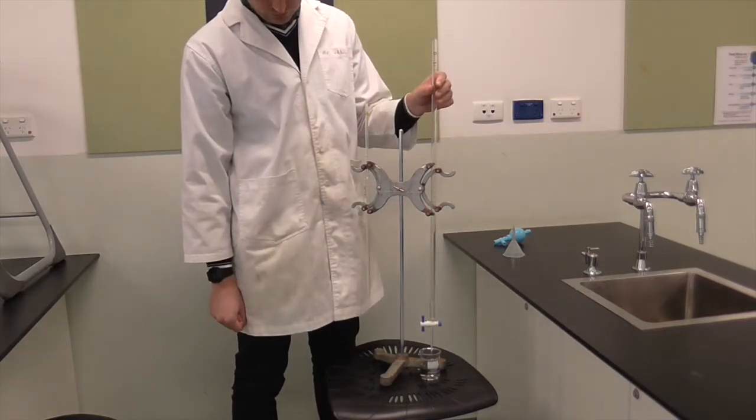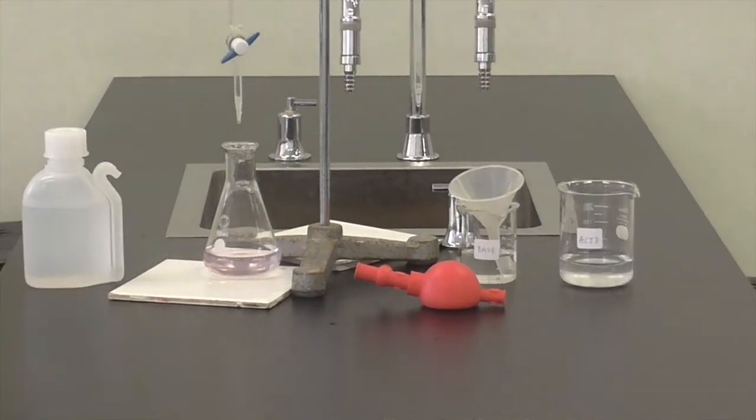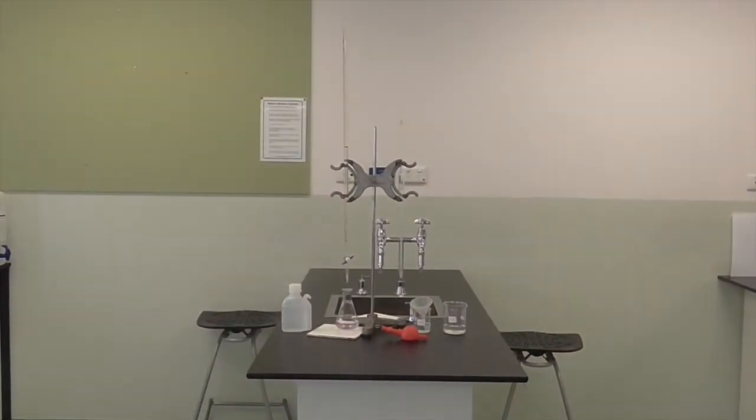Now let's get started on the titration. This is the equipment we're going to use to do our titration. Beakers of acid and base, a funnel, a pipette filler, conical flask, white tile, distilled water, a burette and a pipette in a stand.